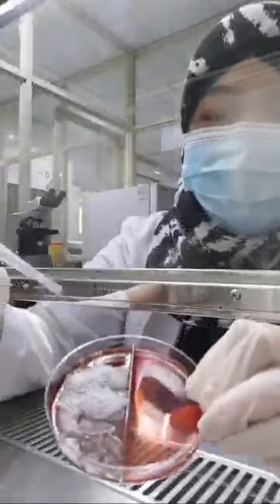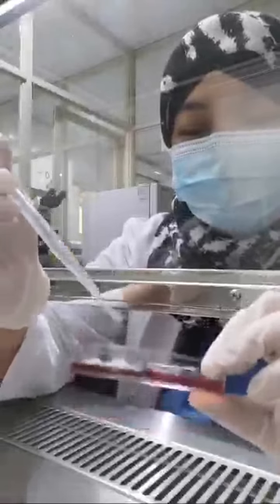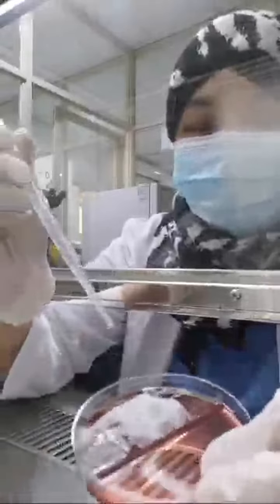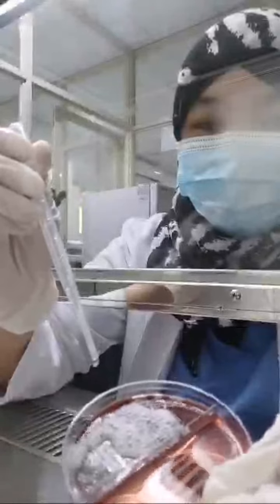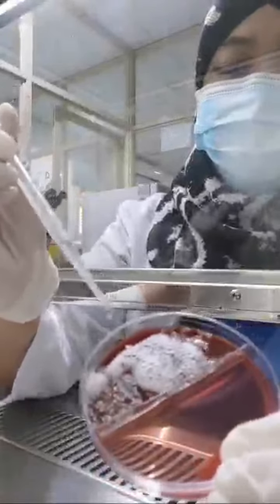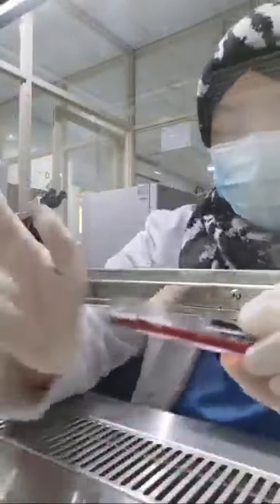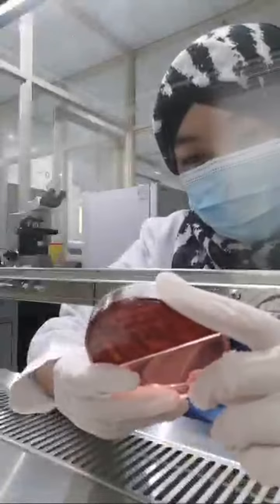See, there's a specific colony only that forms the bubbles. I don't know if you can see it. Not all of the colonies are forming bubbles.